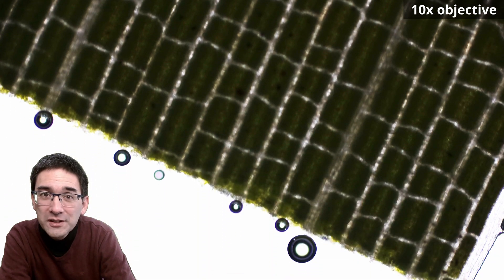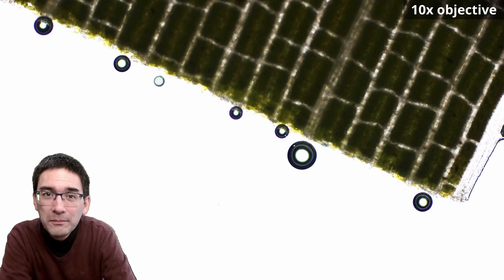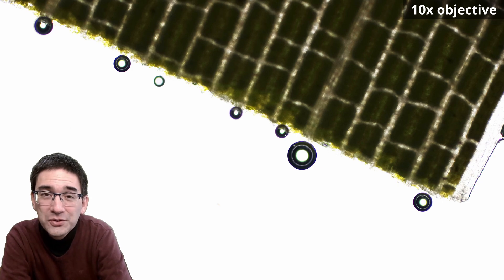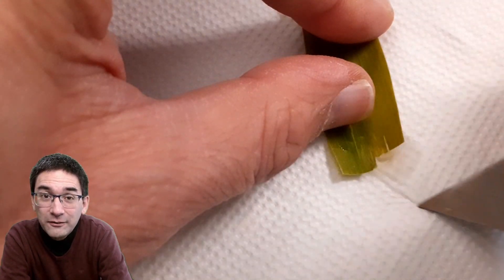Those boxes are just the paths where the water is flowing and not the cell walls. I went up with the magnification and was not able to see the individual cells — a little bit of a disappointment. So I decided I had to think of a method to process the leaf in such a way that I'd be able to see the individual cells, and I did find a way.